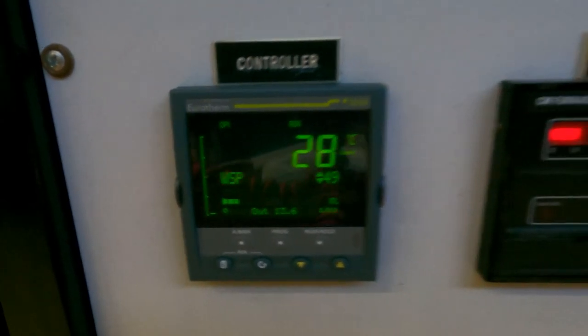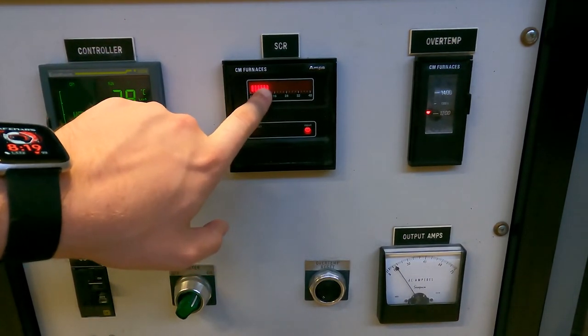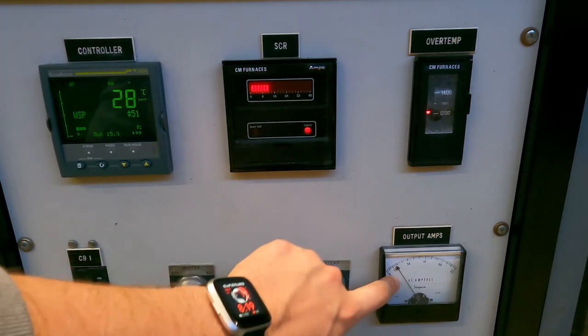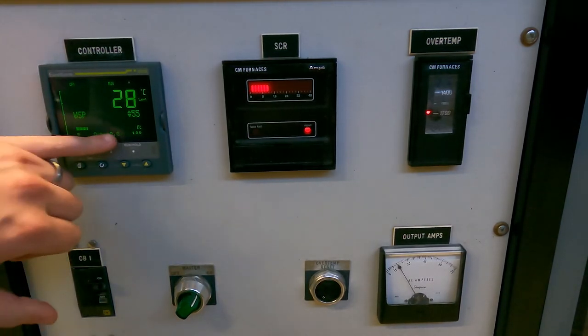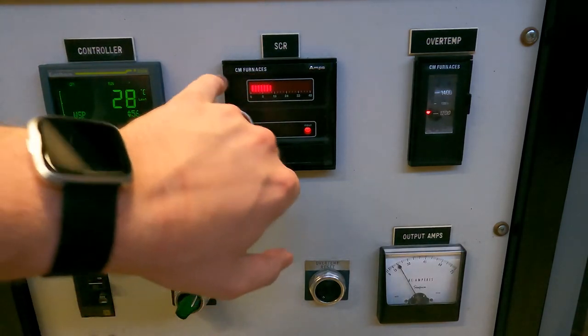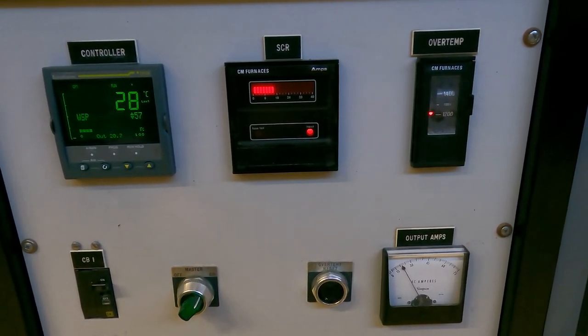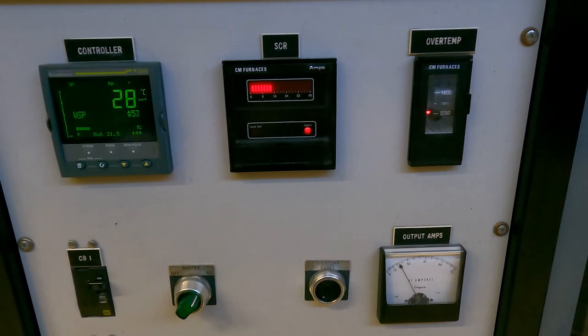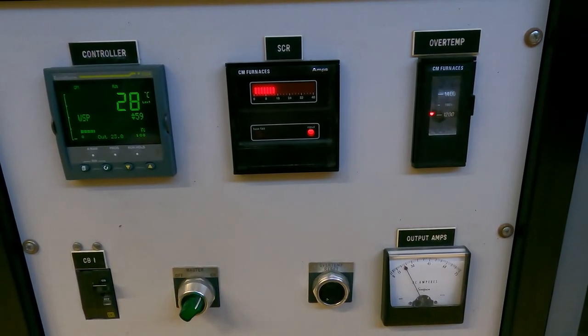Furthermore, if we back up, we can see that the power out on the SCR is starting to go up and the output amps on the amp needle is starting to go up as well. These are all good indicators. If they're jumping around, it's usually indicative of a thermocouple issue. If they're not doing anything, it's indicative of a power issue. If you see that the output power is at 100 on the controller but none of these other things are doing anything, that usually means there's some miscommunication or misconnection, and you're going to have to work on rewiring the stuff in the actual box.